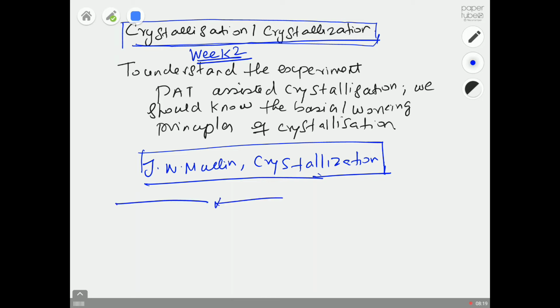That's enough introduction. Now I'm going to say what topics we are going to cover in this lecture. These are the topics you need to understand to know a bit about crystallization, and you will need this knowledge to interpret your experimental data. In the YouTube video I uploaded, I crystallized paracetamol.